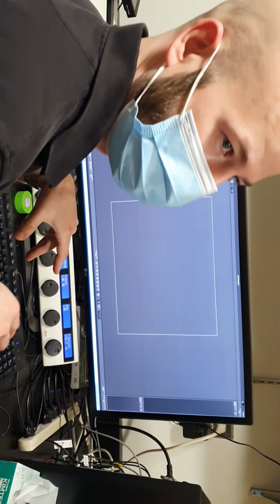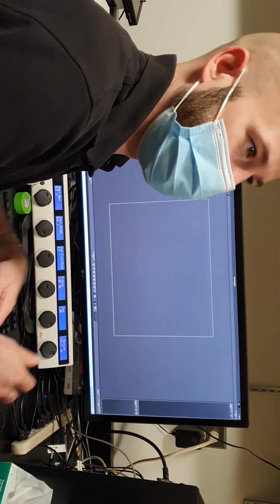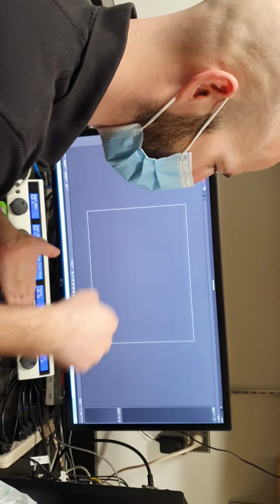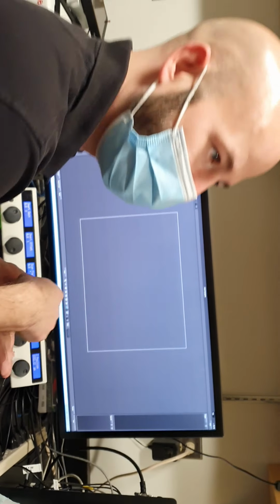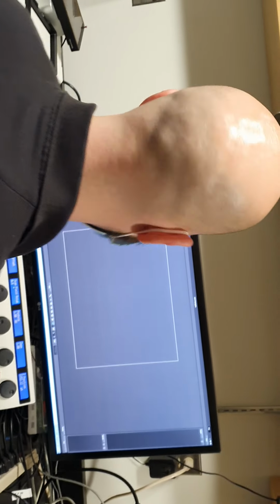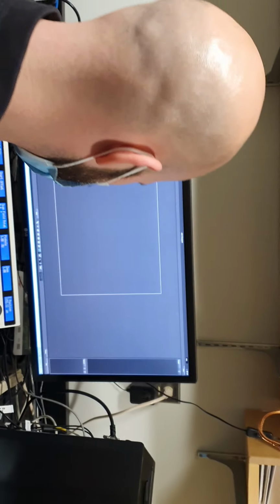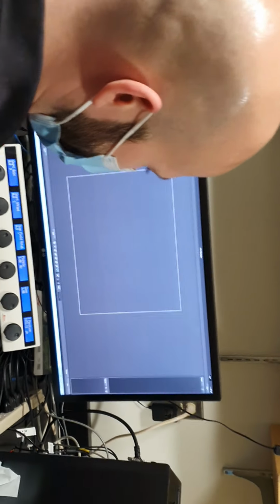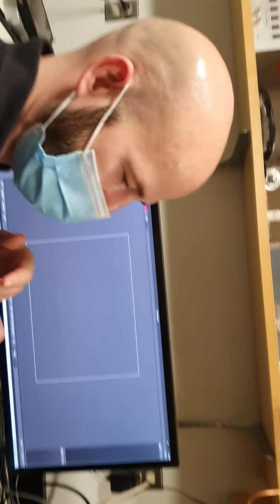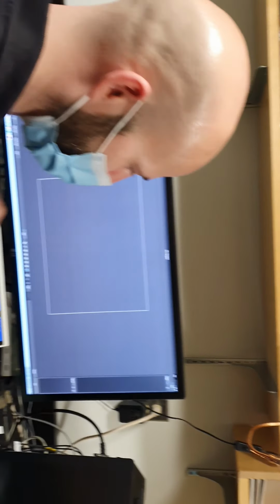So you could do wide field fluorescence with a low magnification objective to quickly do an overview of your whole tissue section. And then you could pick individual fields and say, go back to these specific fields, but do it in confocal imaging with a higher magnification and higher image quality, or do an entire Z-stack at these positions. And that's particularly helpful if you're saying, I want images in a certain region of the heart, if I want a certain number of images in an infarct border zone versus in a remote region. It helps to have that.